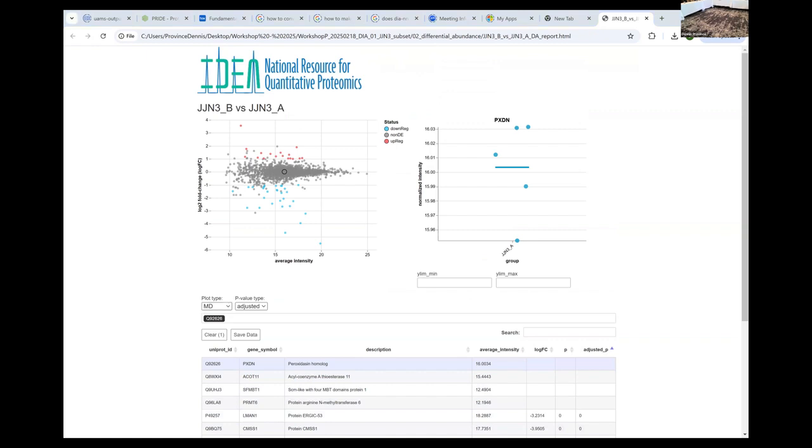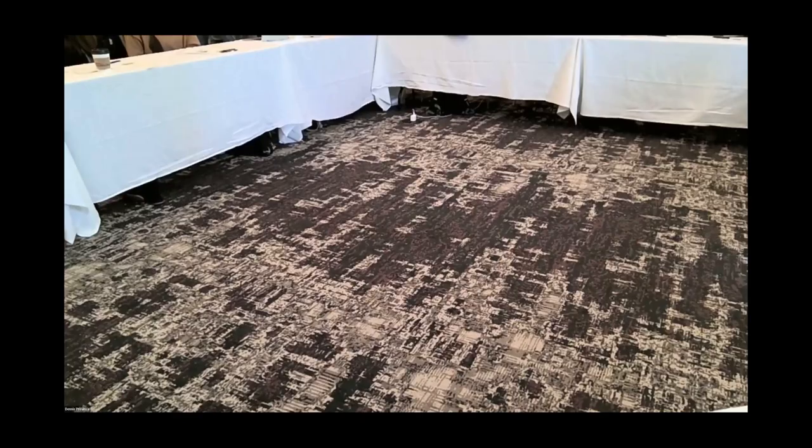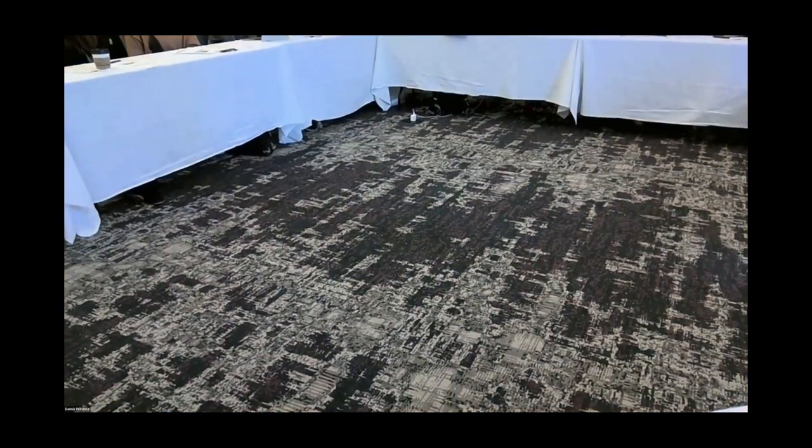The other part that is, let's see here. I want to make sure that when I share the screen, are you guys able to see the spreadsheet now, or do I need to go? No, I don't see a spreadsheet. Okay. I think I have to share. I'm sure I'm doing this wrong, but okay.